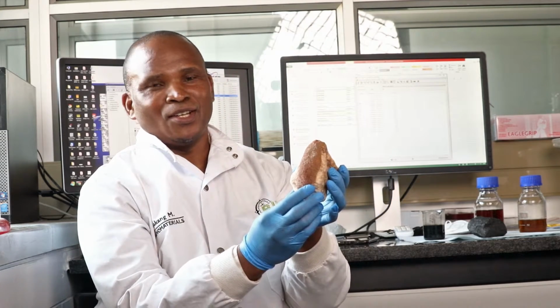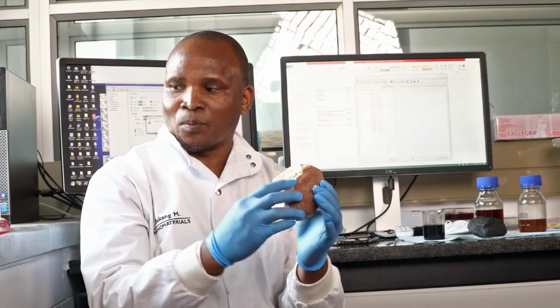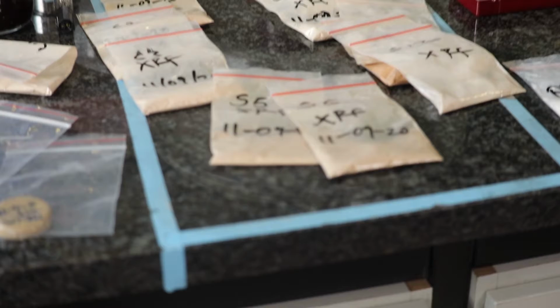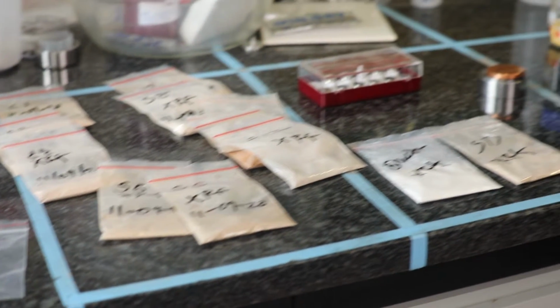Then we have the mining sectors, like the rocks. Here's one of the samples. The sample doesn't go in as it is. We first have to prepare it by pulverizing it to powder. And then once it's powdered, we check that it should be less than 56 microns for particle size. And then that is when it can go into the system.